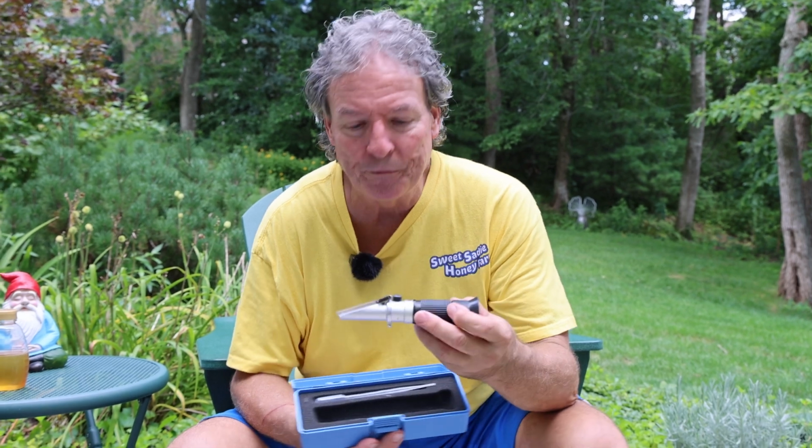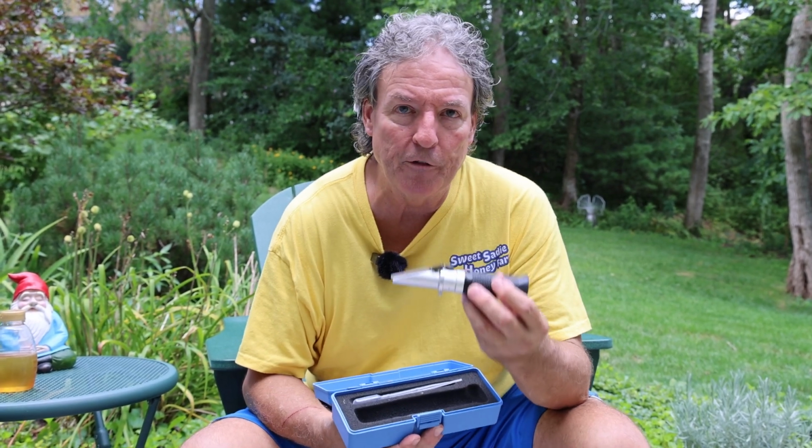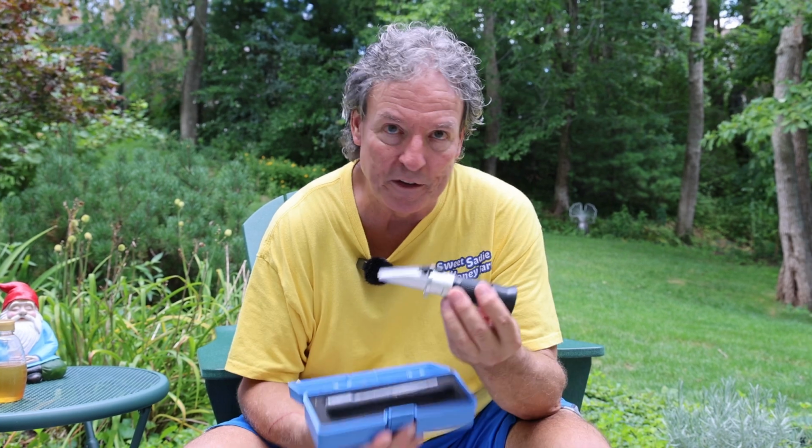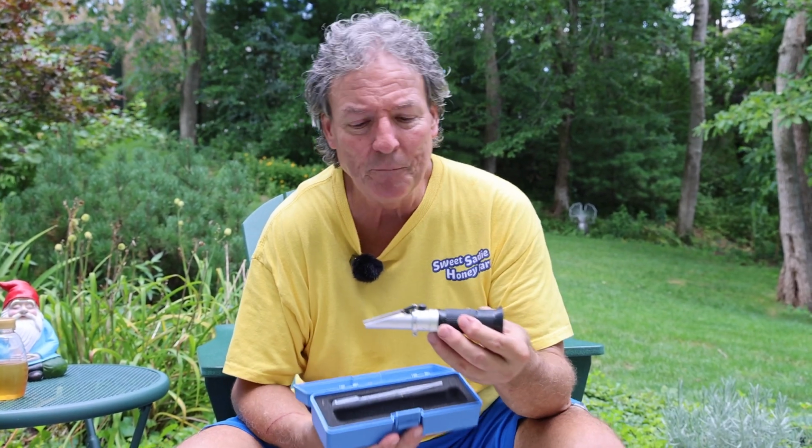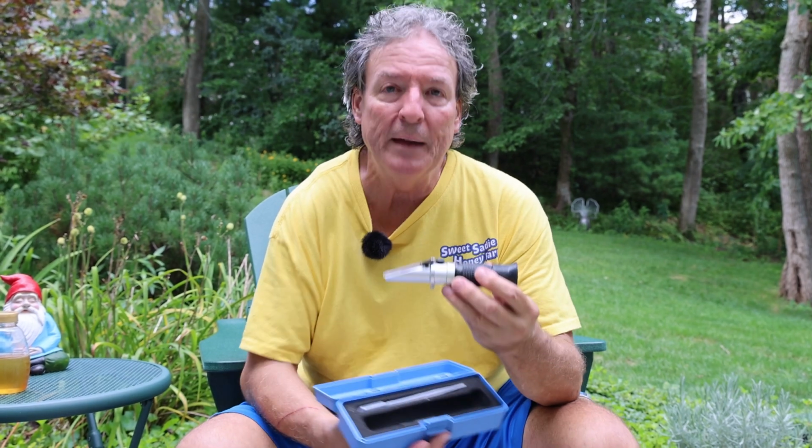And this is a refractometer. So what does it do? It measures the moisture level in honey. It can measure the moisture level in just about anything. As beekeepers, we use it to measure the moisture level of honey. Why is that important? Well, it's important for one main reason.